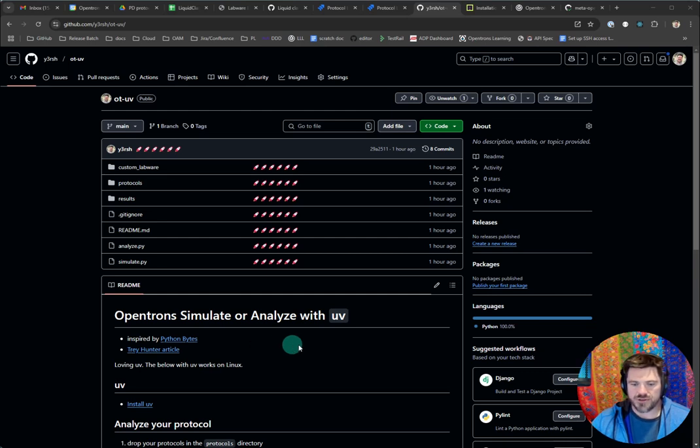All right, hello everybody. I want to do a video that may help you as you try to use Opentrons Simulate as well as Analyze on the command line using the Opentrons Python packages. Traditionally, it's been challenging for everyone to set up Python in the right version, to set up virtual environments of the right version, and to manage your versions of the Opentrons packages. We require for the Opentrons stack Python 3.10 and that you have some dependencies installed so that you can do simulate or analyze on the command line.